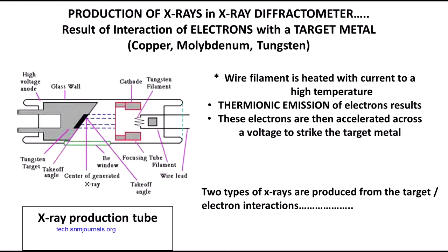The X-rays generated from the electron beam interaction with the copper target can emerge out of the copper, and by suitable design of the target and X-ray tube geometry, they can travel out of the tube through a window. Often the window is made of beryllium, which is a very low atomic number metal that allows the X-rays to pass through it without significant absorption.